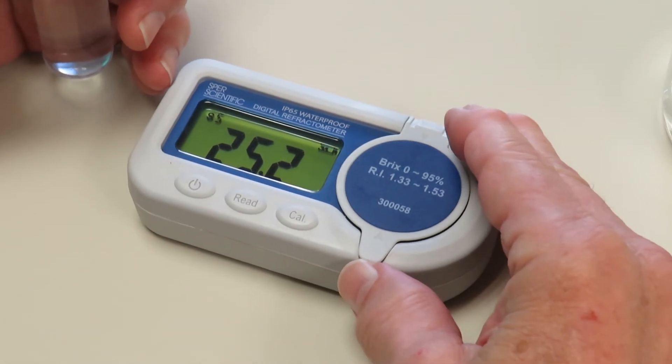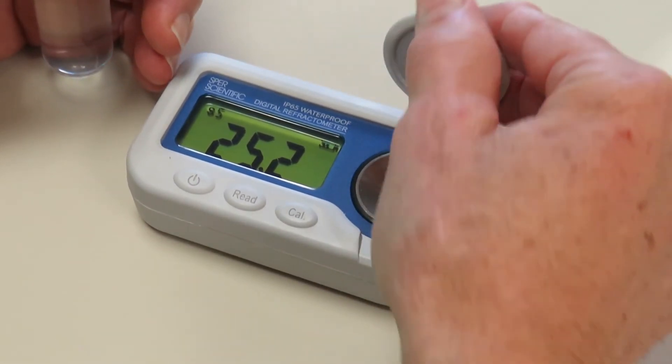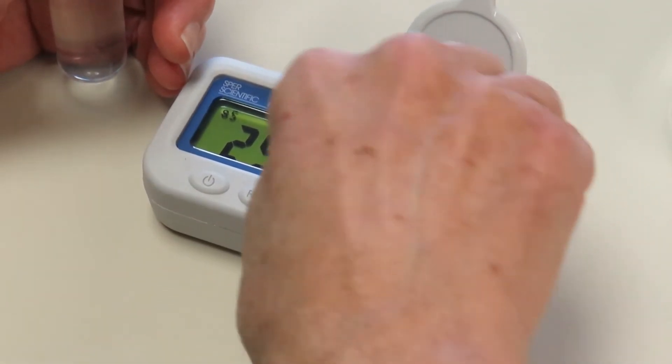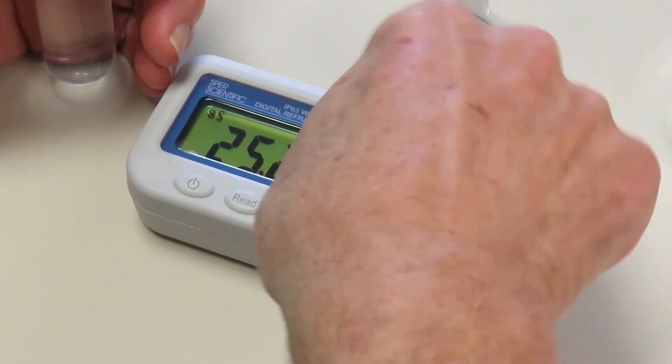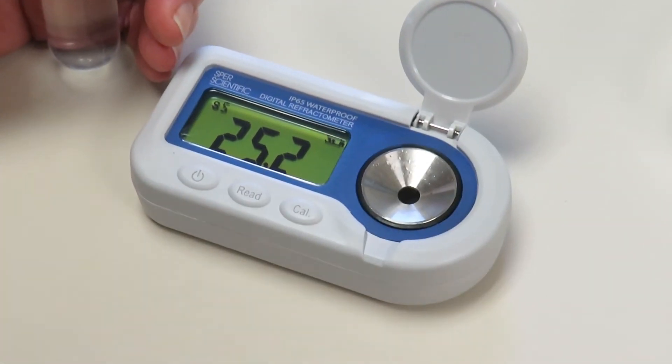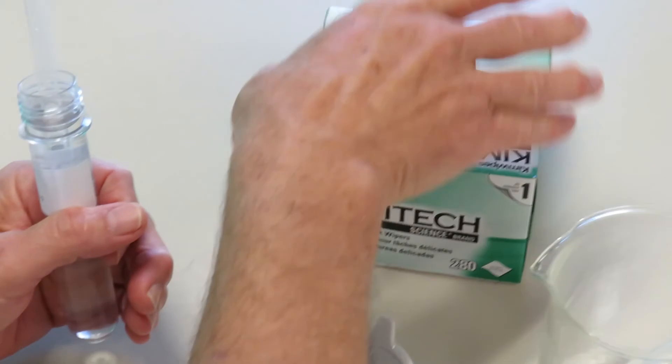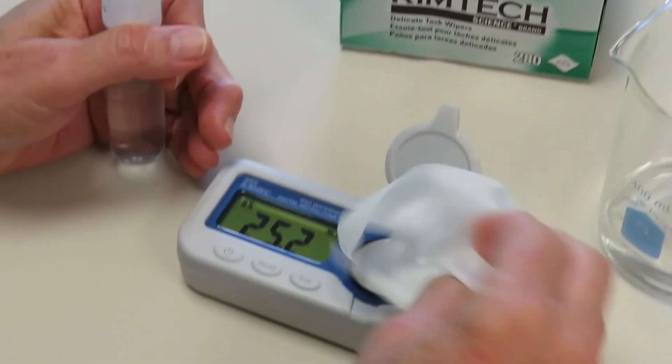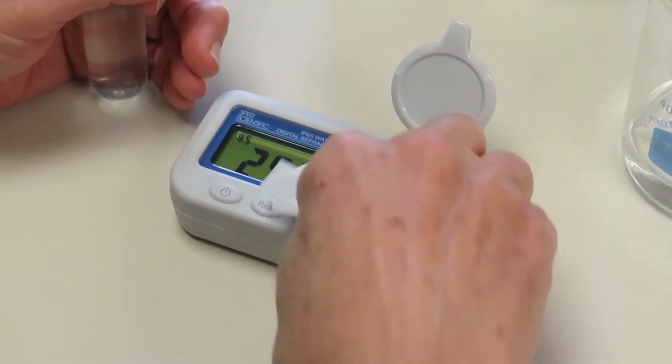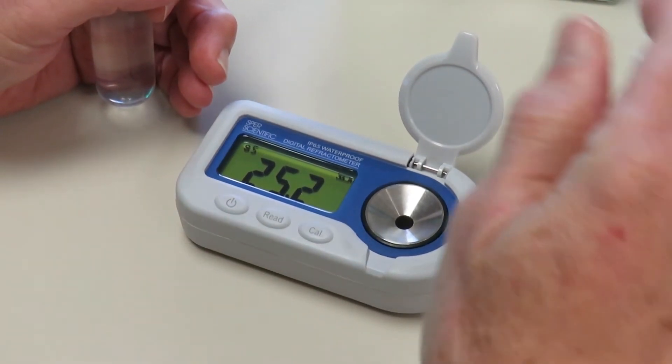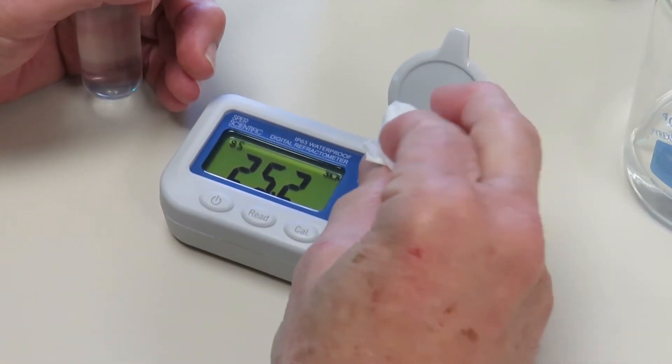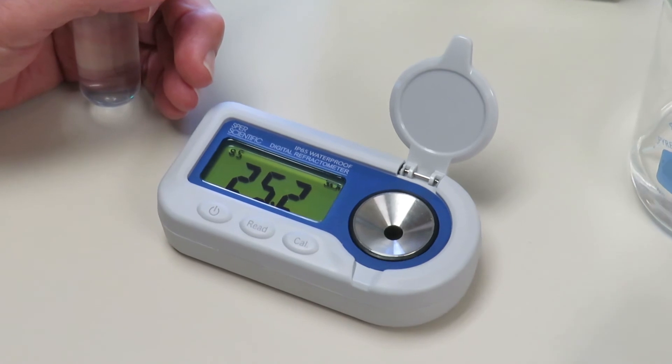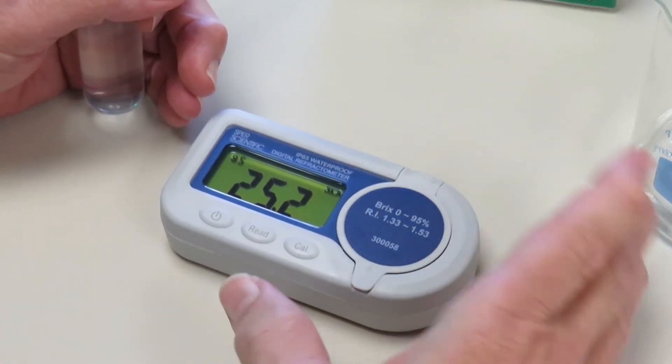We just have to make sure between readings and between solutions that we clean the lens off very carefully, and that we use a lint-free cloth like I'm using here, because any kind of lint will give you a false reading as the instrument is very sensitive. So you just rinse that with water, and now you can take the reading of a different substance. And that's it.